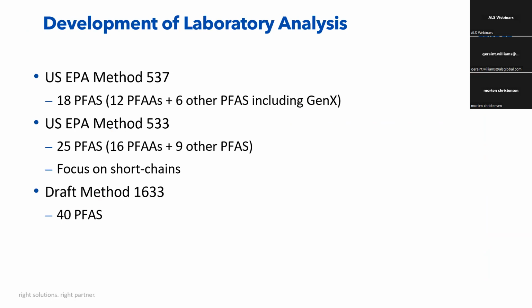We've seen an evolution of laboratory analytical techniques, and you can see from here, these are the standard targeted analytical methods that are widely available now. And I know in the US, they're very prescriptive in terms of the kind of methods that are used, and that's not the case in all parts of the world. But one of the things we don't see with TOP assay is a standardized documented method, in the same way as we've got methods for more targeted analytical techniques. So that's just one of the limitations perhaps to be aware of, that there isn't this standardized, documented approach that is used very widely for all the labs.